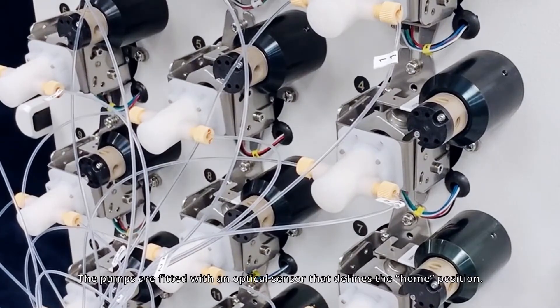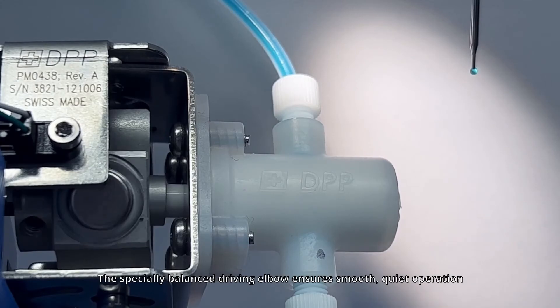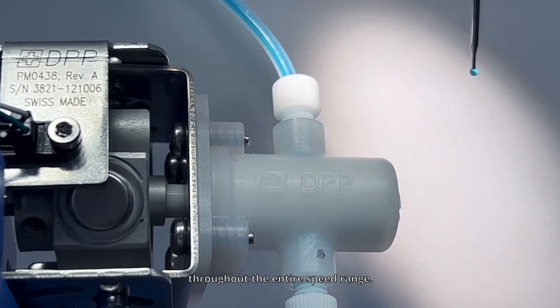The pumps are fitted with an optical sensor that defines the home position. The specially balanced driving elbow ensures smooth, quiet operation throughout the entire speed range.